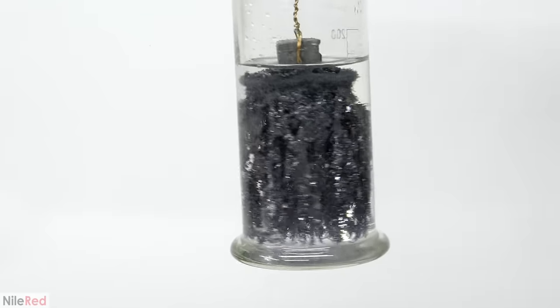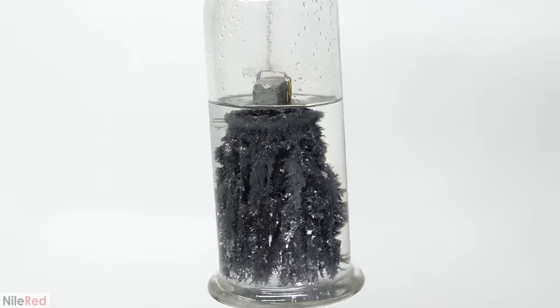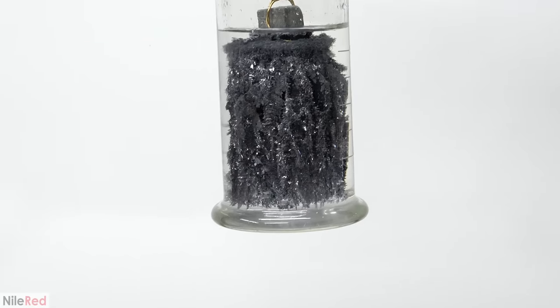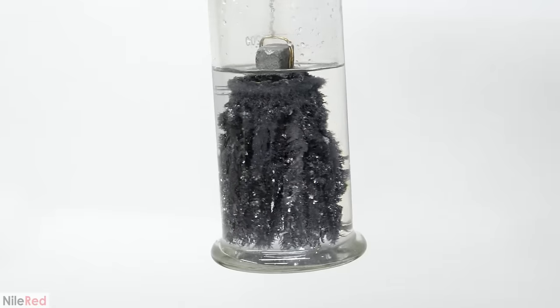Three days later, this is the final result. It's definitely quite interesting looking, and I'm really curious to see how it'll change over time. It is sealed decently well, so I'm hoping it'll last at least a year or more, assuming I don't knock it over or something.